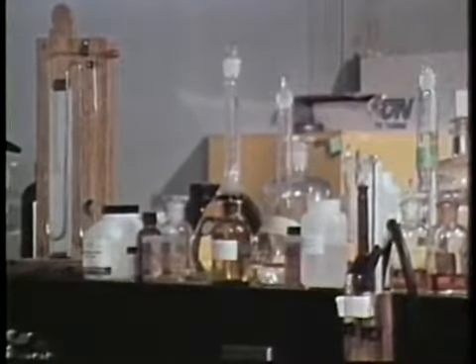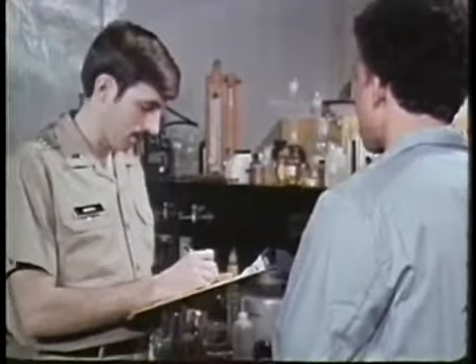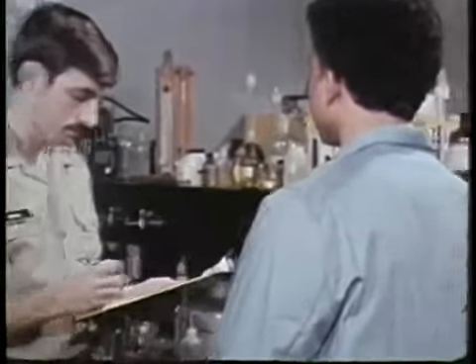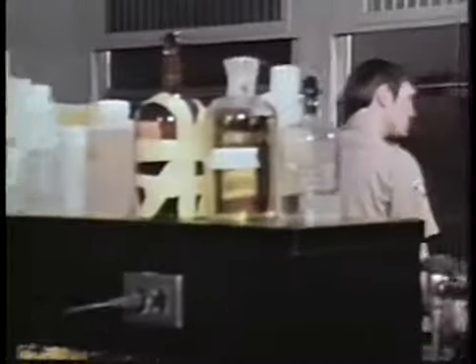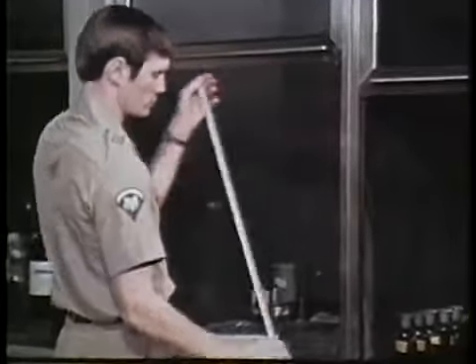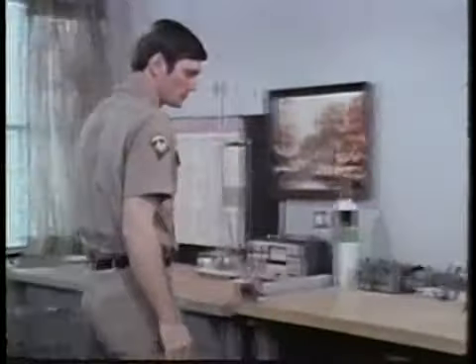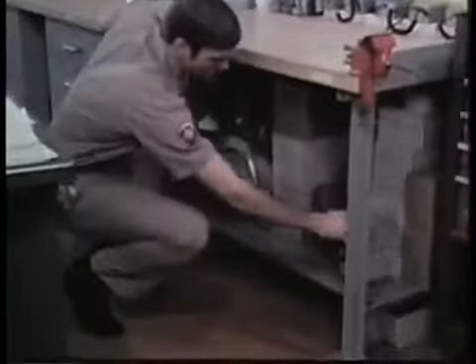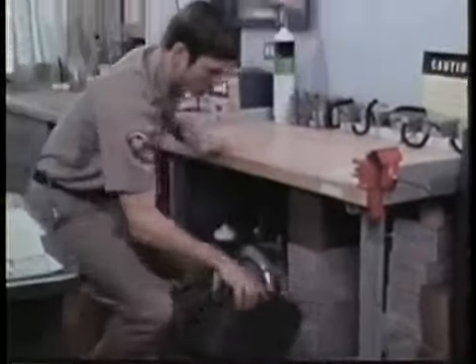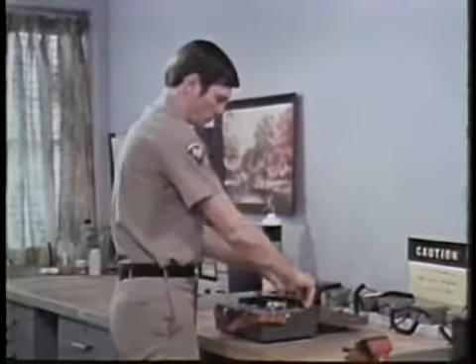During the preliminary survey at this lab, you find out if the supervisor and the workers know what protective equipment is required and if they use it. And you collect other data you'll need. Reviewing the data you've gathered, you then select the instruments you'll need to evaluate the work environments and prepare them for use. We'll go through the checkout procedures for these common instruments.